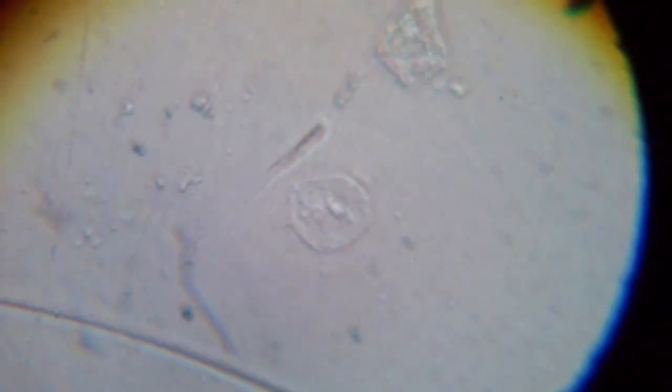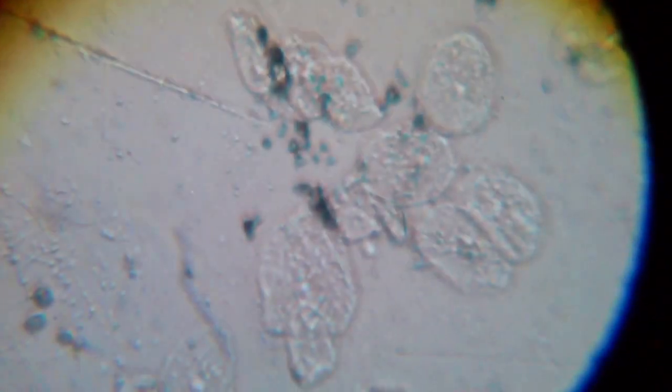Now let's move to the epithelial cells of the mouth. This one is one of them. Here's a bunch of cells right here. It's not colored because I didn't stain them.